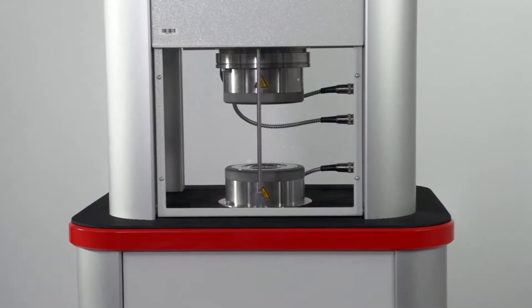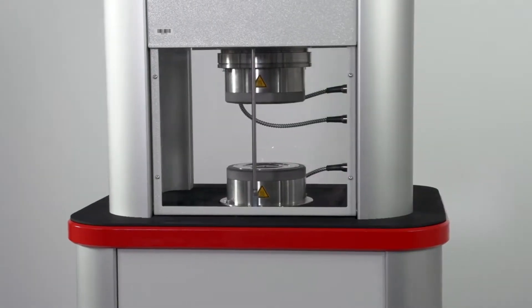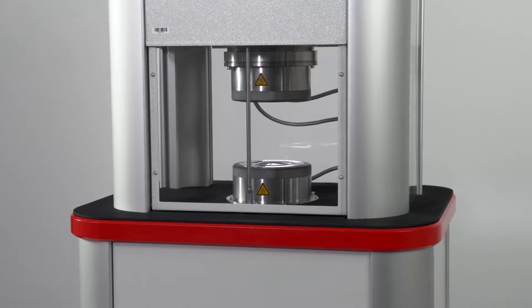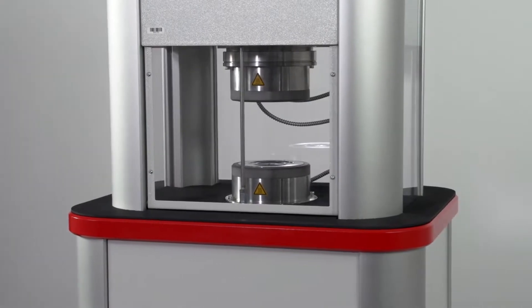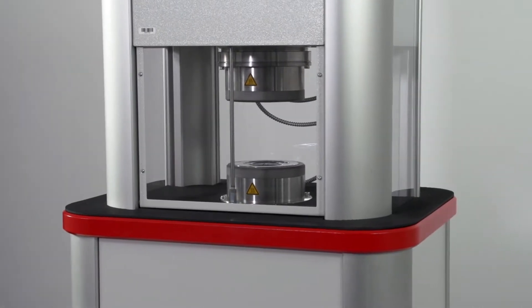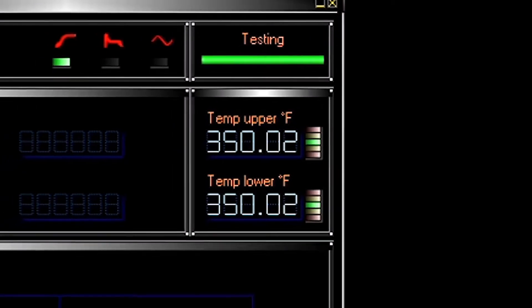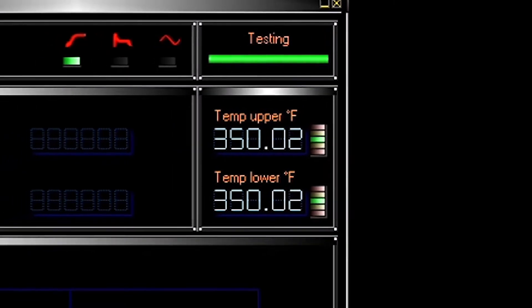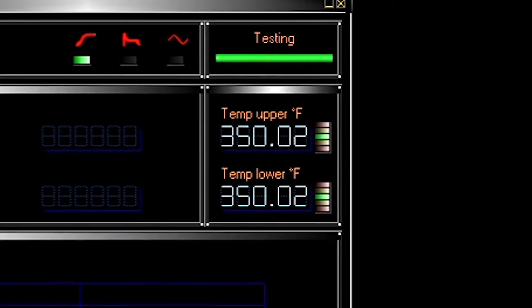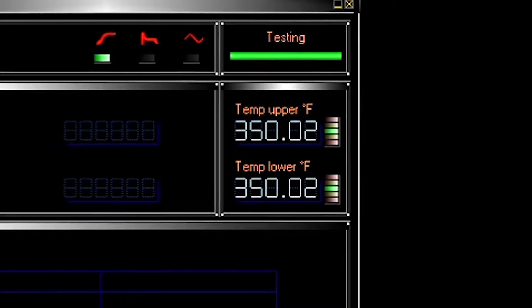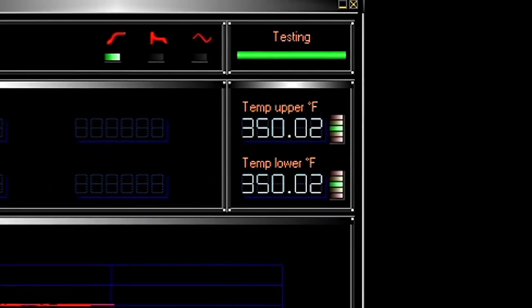Both the upper and lower biconical dies are equipped with a PT100 resistance thermometer, allowing the temperature of both dies to be independently controlled and monitored up to 232 degrees Celsius through MONControl software.